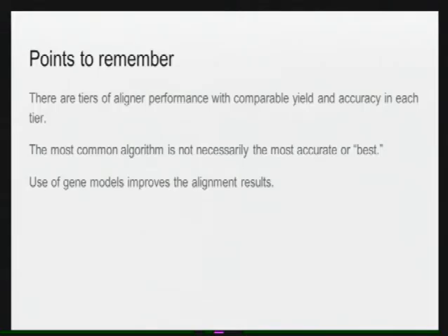But I tend to not switch from aligner to aligner, because for me it's important to have a record of the performance of the aligner over time, so that I can understand better if it's not working very well and I'm not getting very good results from it. If I haven't used it very much and it gives me erroneous results, I might not be able to find those as well. Sorry, that was a long answer to a short question.